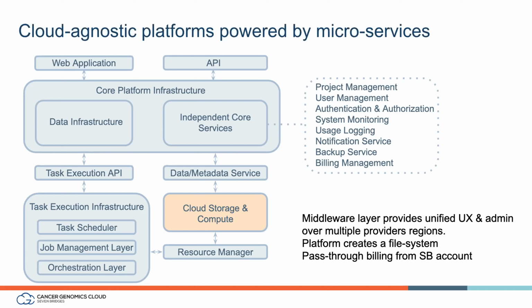Everything associated with metadata is also handled through the file system. By having all the metadata information available in the file system, it enables us to do things like search very quickly, or batch, like I discussed a few minutes ago, very quickly. And this is basically a more streamlined user experience.